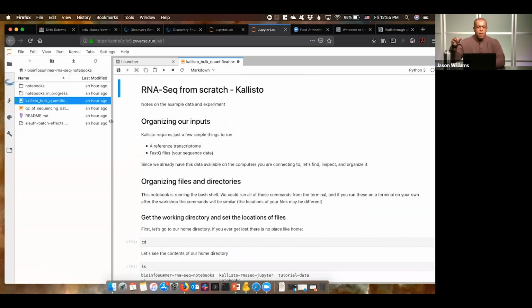It really takes things in a more sophisticated direction if you're moving from what we hope are freshman and sophomore course-based research experiences, where once people get the fundamentals using the Subway, then you can take them and do even more custom things.